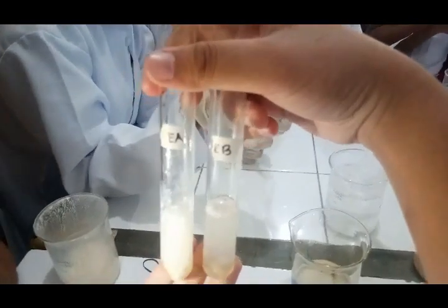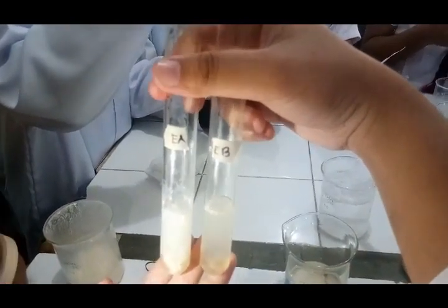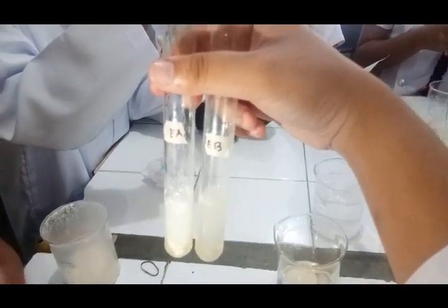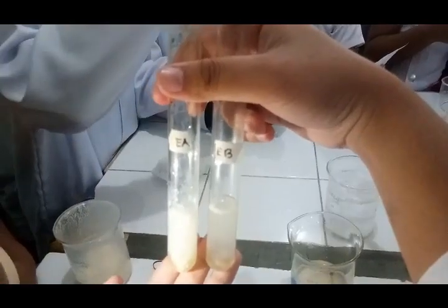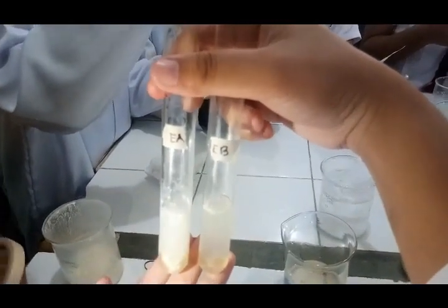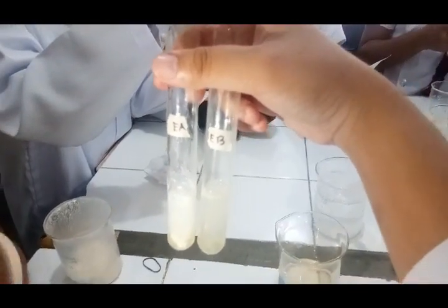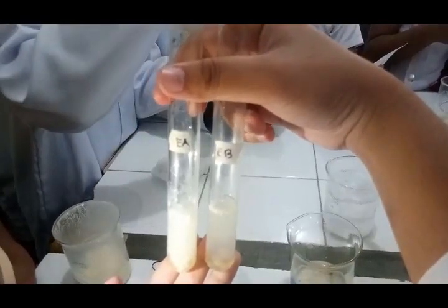We proceeded with the experiment in testing the egg white. Egg white showed strong turbidity in both reagents, with some leftovers. Trichloroacetic acid, however, has a stronger affinity than test tube B, as compared by the turbidity. Strong precipitation is probably due to the presence of the protein albumin in the egg white. However, it is pale in comparison with the two milk variants.